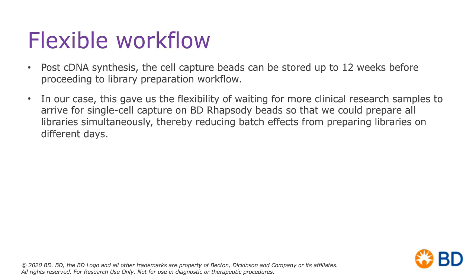So in this particular experiment, this flexible workflow gave us the flexibility of waiting for more clinical research samples to arrive before we decided to do our full library prep and our sequencing. It also allowed us to process our samples on different days as needed.